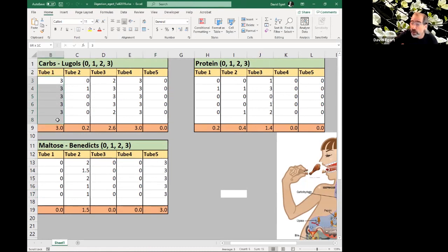Here we can see tube 1 again and again. People found starch was there with no maltose. The one with spit and starch, there was no starch left, but maltose showing up. The one with the acid, there was still starch and no maltose. So this is actually useful, being able to have this data to show in your write-up that your observations from the one that we did in the lab are supported by this greater group data as well, right? Because you don't want to just do something once and say, I got the answer. You want to make sure if you do it again and again, you keep getting the same answer before you really trust it.